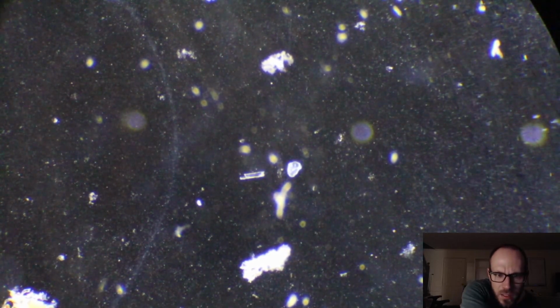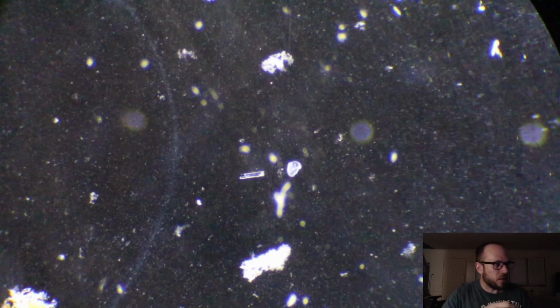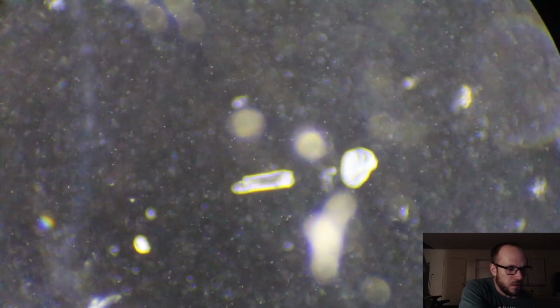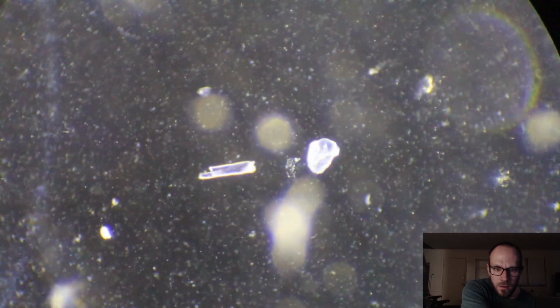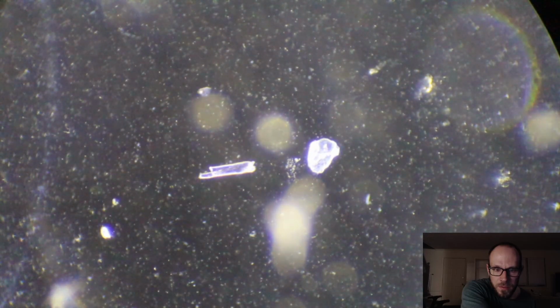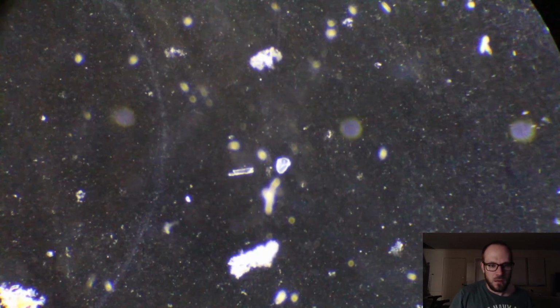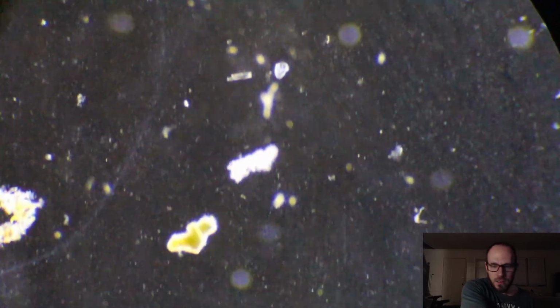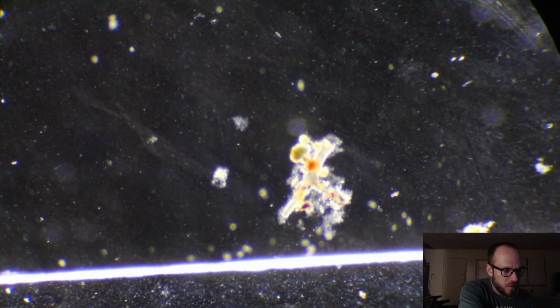What is this? Not sure what I'm looking at, if it's anything at all. Let's switch to 100x. Might be just scratched glass. Alright, continuing. We're almost through with this slide. Oh, that's tinged red a little.